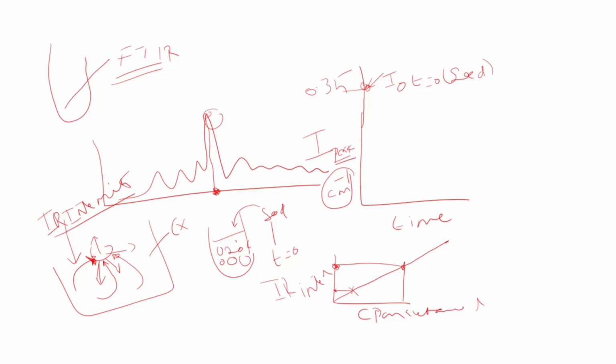So what we are doing in the experiment is, we add this FTIR probe, and then we monitor the IR intensity. Say you started from 0.35, it will decrease with time, and that's happening because your crystals are growing. Your crystals are growing. They will become bigger and bigger, and then eventually it will reach a saturation. Yeah?